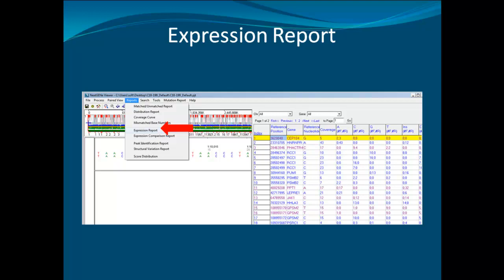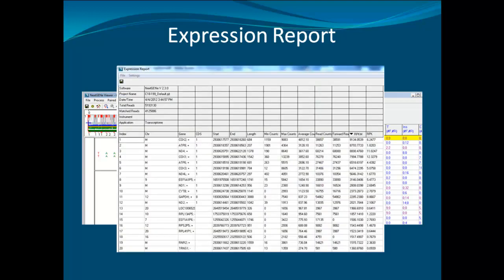NextGene also offers an expression report, which can be accessed under the report menu from the normal view. The expression report displays different expression measurements for the entire project. The table can be sorted by double-clicking a column header.